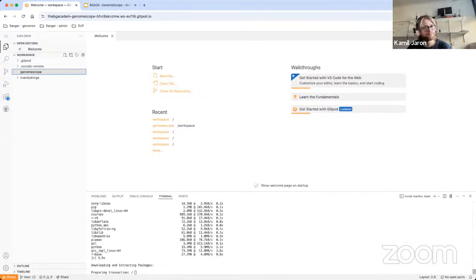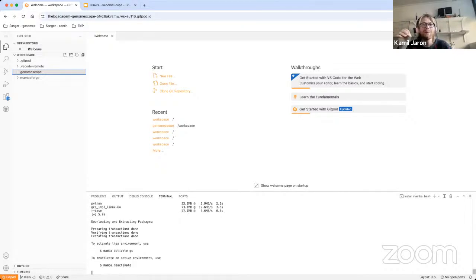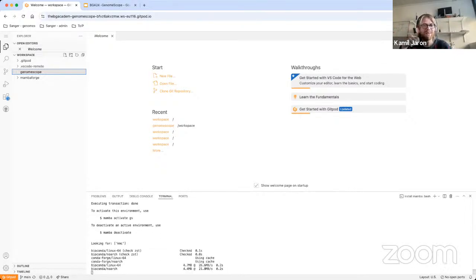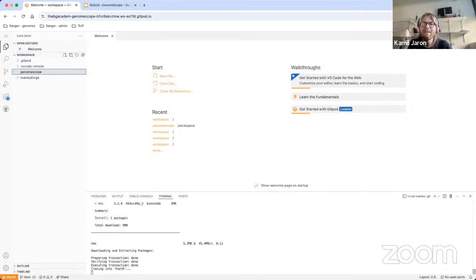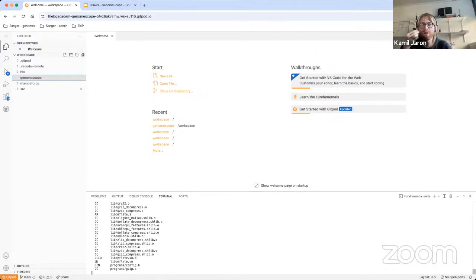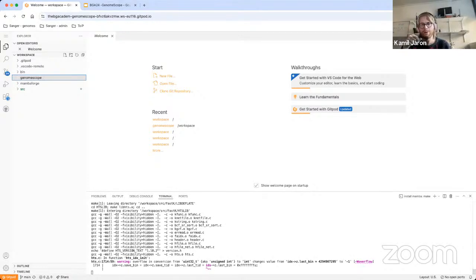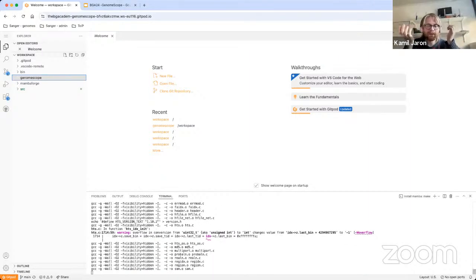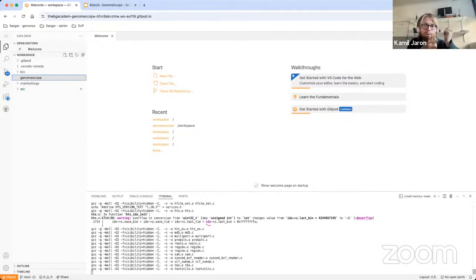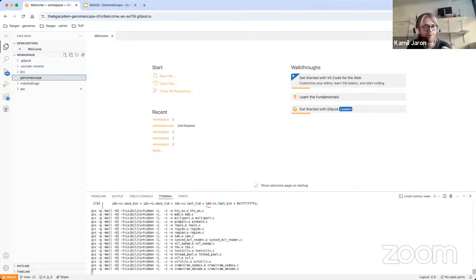If you have low coverage, so for short reads, changing the K actually affects the coverage more than for long reads. Why is that? I will leave that as homework, or you can just read some tutorials. It's not that complicated, but it takes a few minutes. Quite often, when I had very low coverage Illumina data sets and I really wanted to get the genome profiling model right, I lowered the K to 17. When I really needed to ramp up that coverage, I wanted the Kmer coverage to be as high as possible.